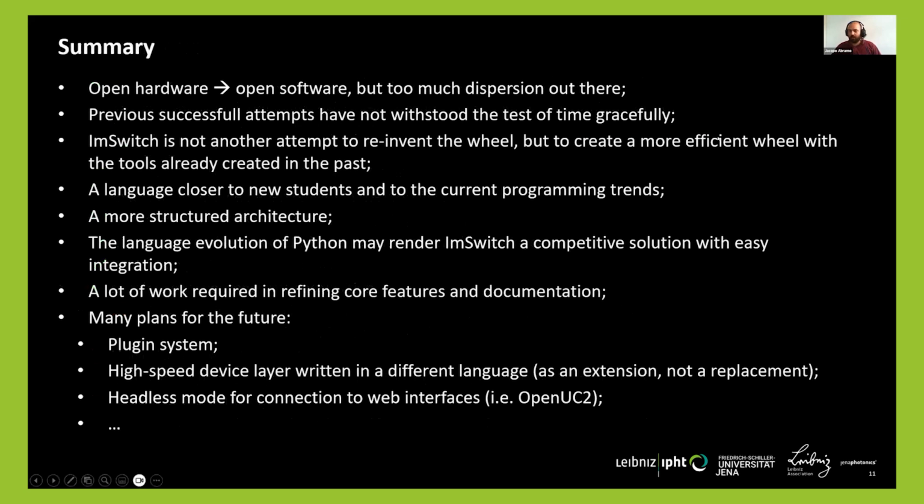So in summary, I made this presentation only to make a point in relation to the current status of open source software, because we have a lot of open hardware, but this also comes with a lot of open software, and there is a hard time bridging all the communication with all these devices together in order to create more complex but synchronized solutions. We have previous examples of something that worked, like Micro-Manager, but this has not withstood the test of time very gracefully.